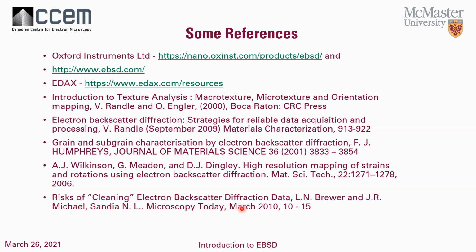And from the Sandia Labs people, they did a nice article in Microscopy Today talking about the risks of cleaning using the data substitution method. Quite useful reading that.